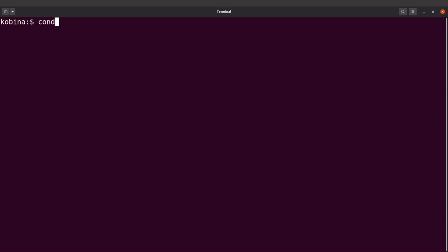So I'll say conda config add channels, and I'll say bioconda. I'll add a second one. So I'll say conda config add channels, and I'll say conda-forge.